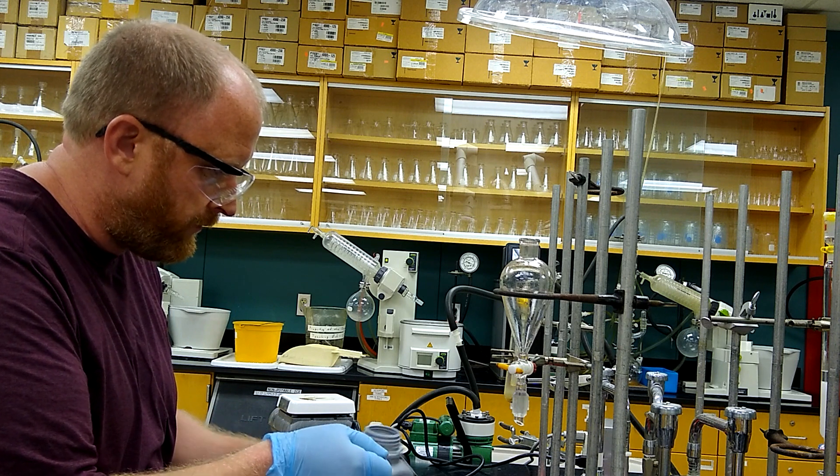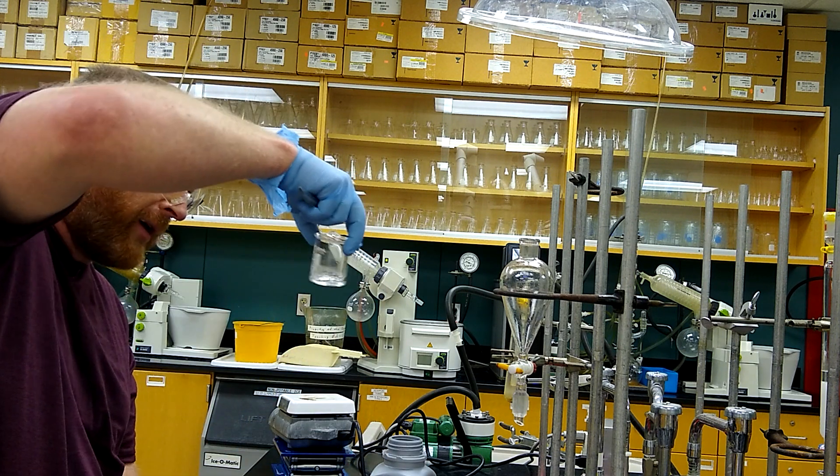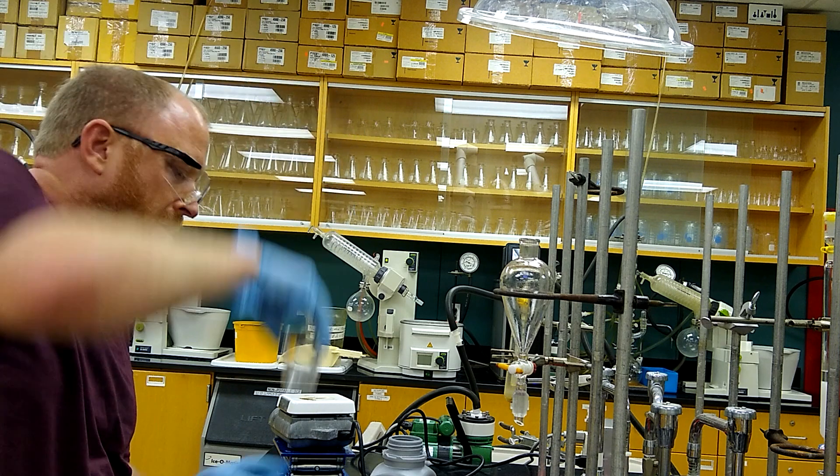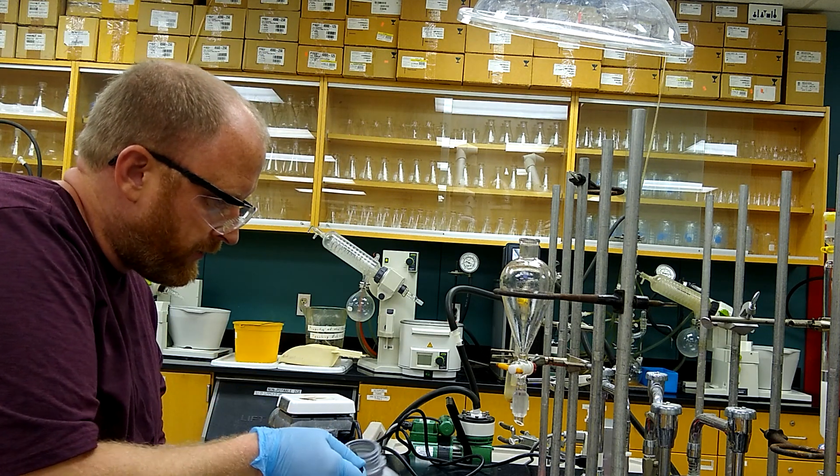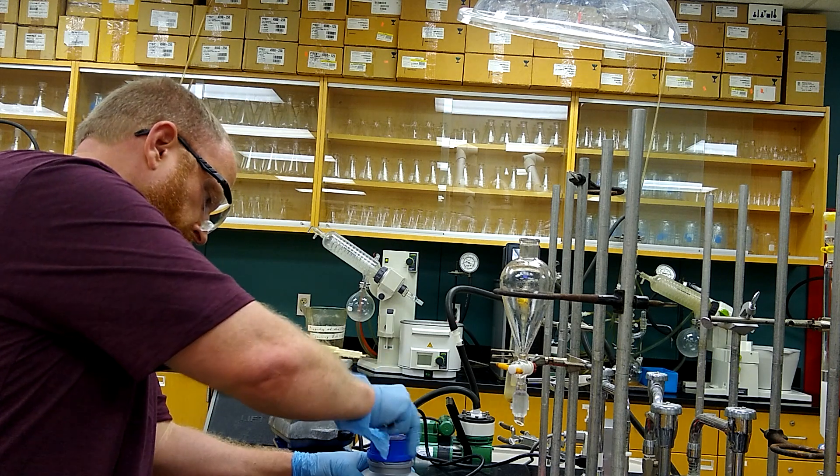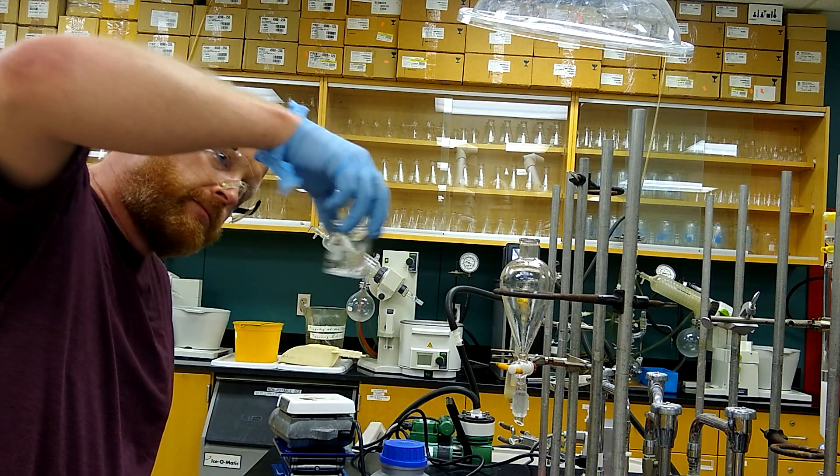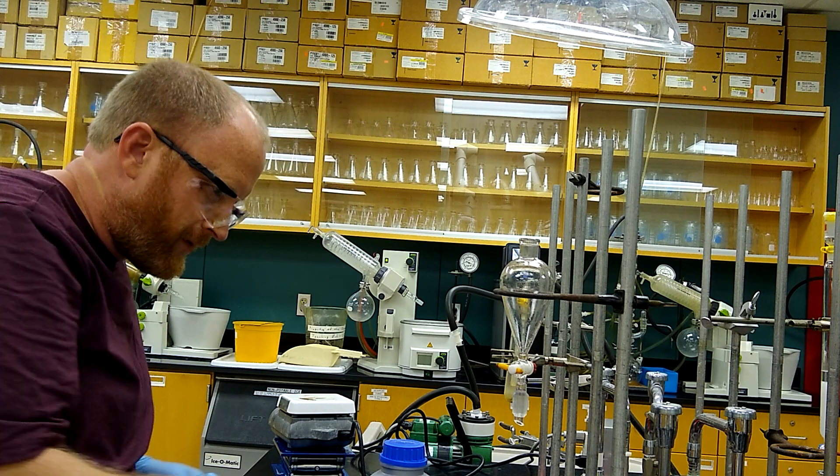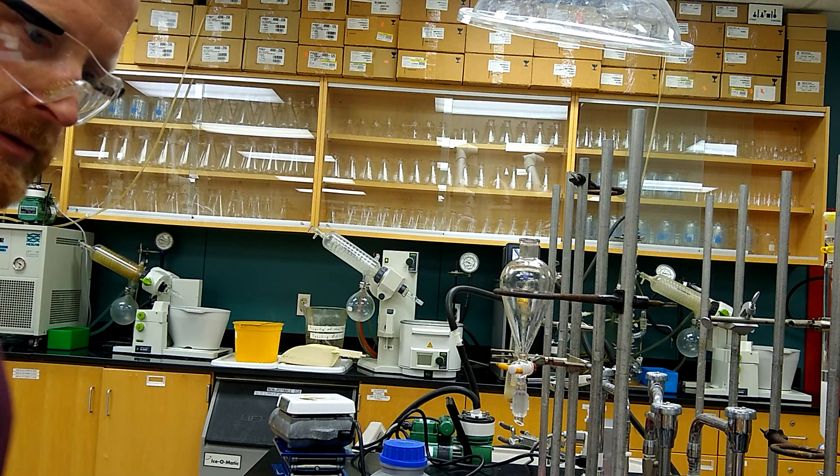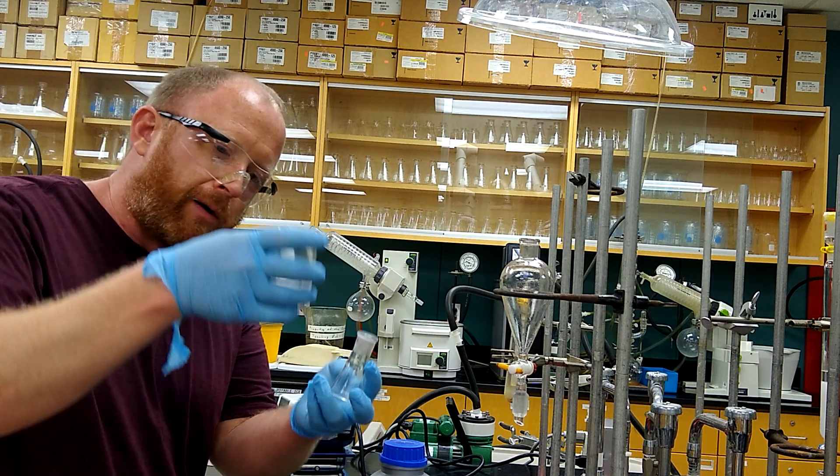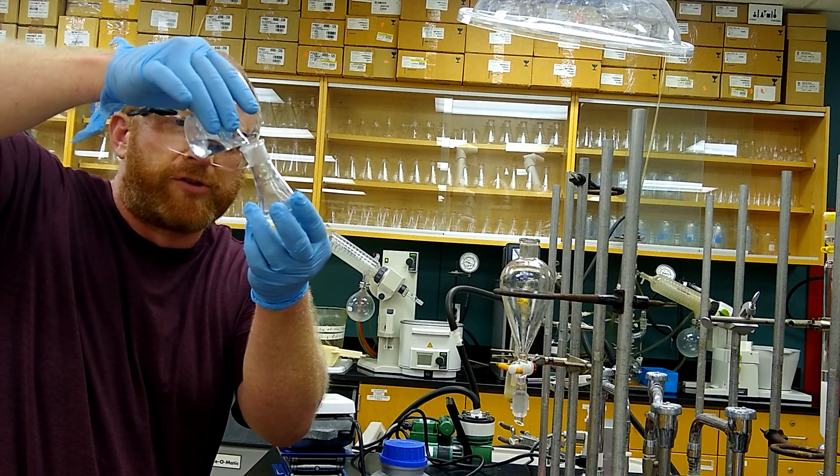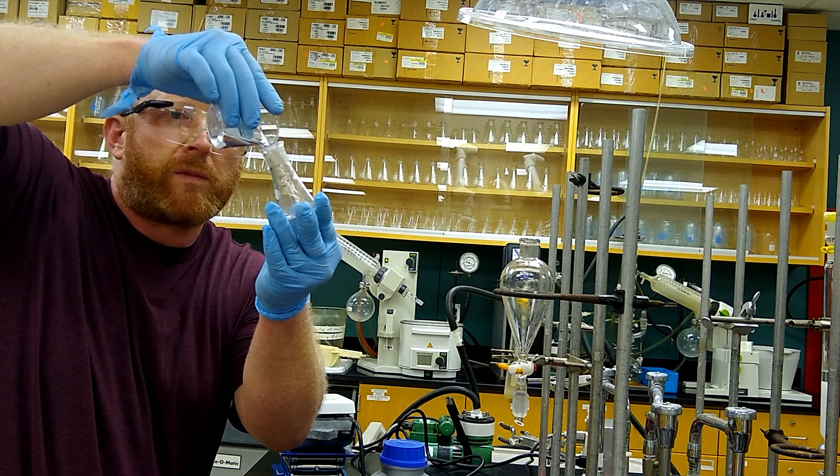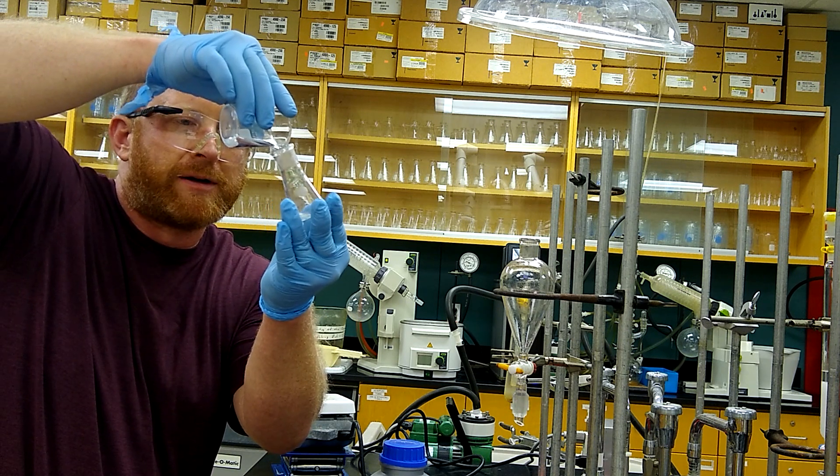I'm adding some calcium chloride until I'm not really seeing any clumping going on. I think that's probably sufficient here. Now I'm just going to decant, getting as much of that ether over as I can without getting the drying agent into my flask. We'll call that good; we don't need it to be perfect.